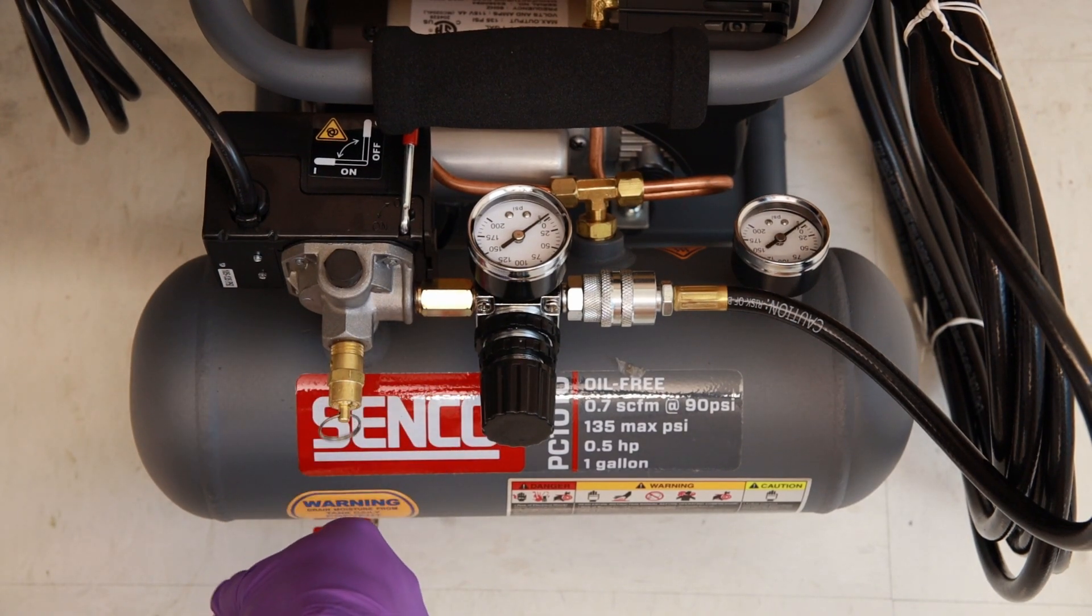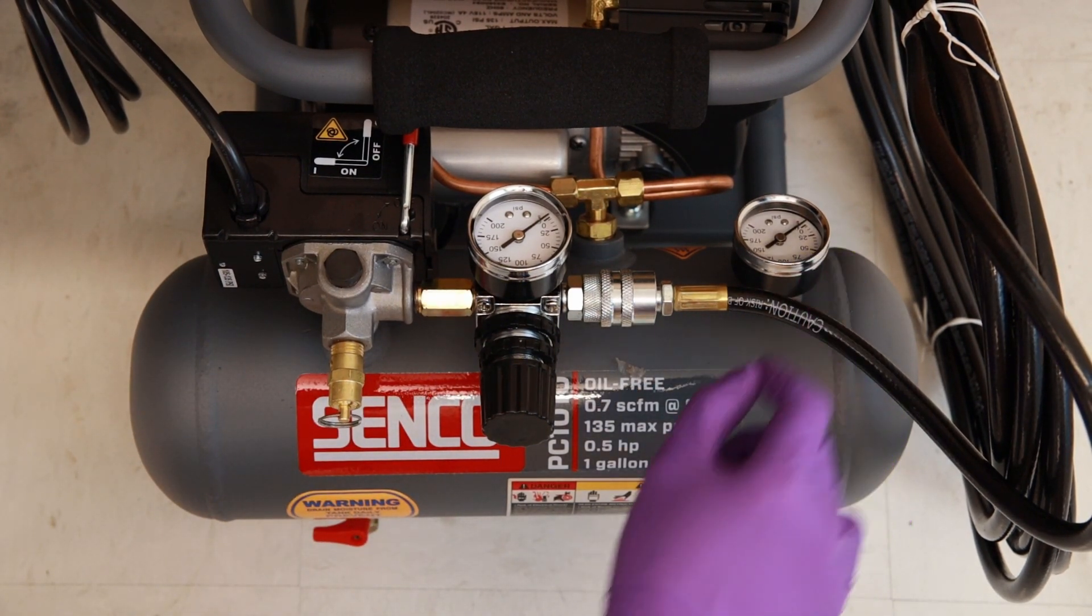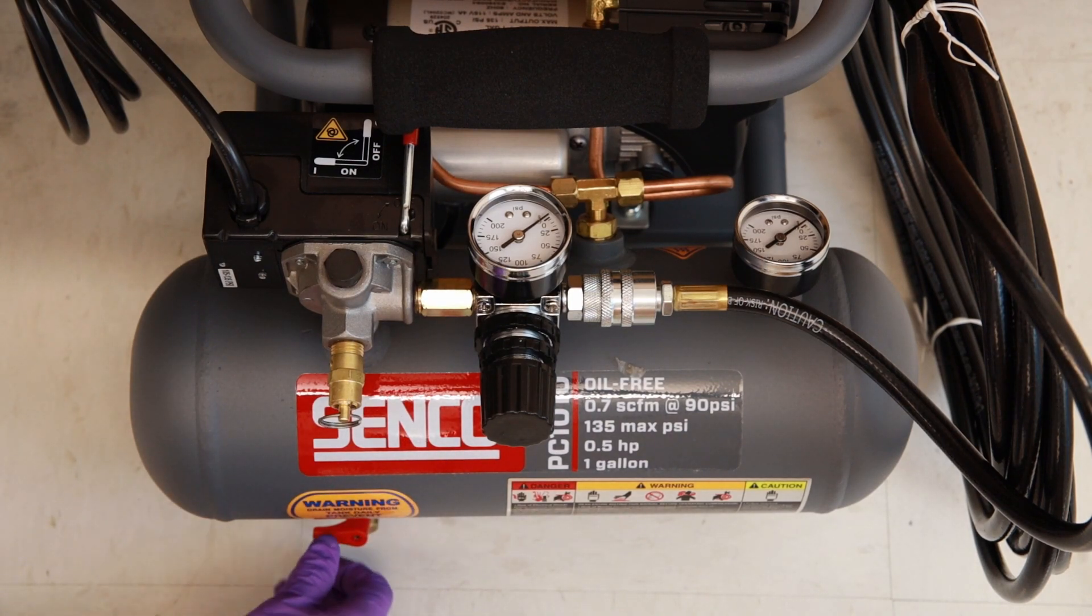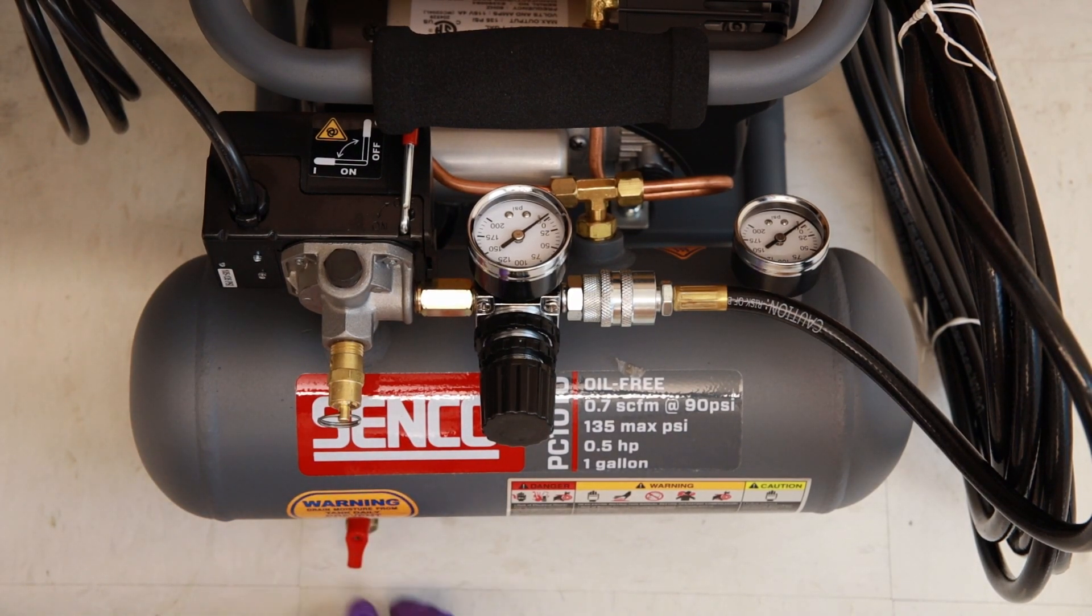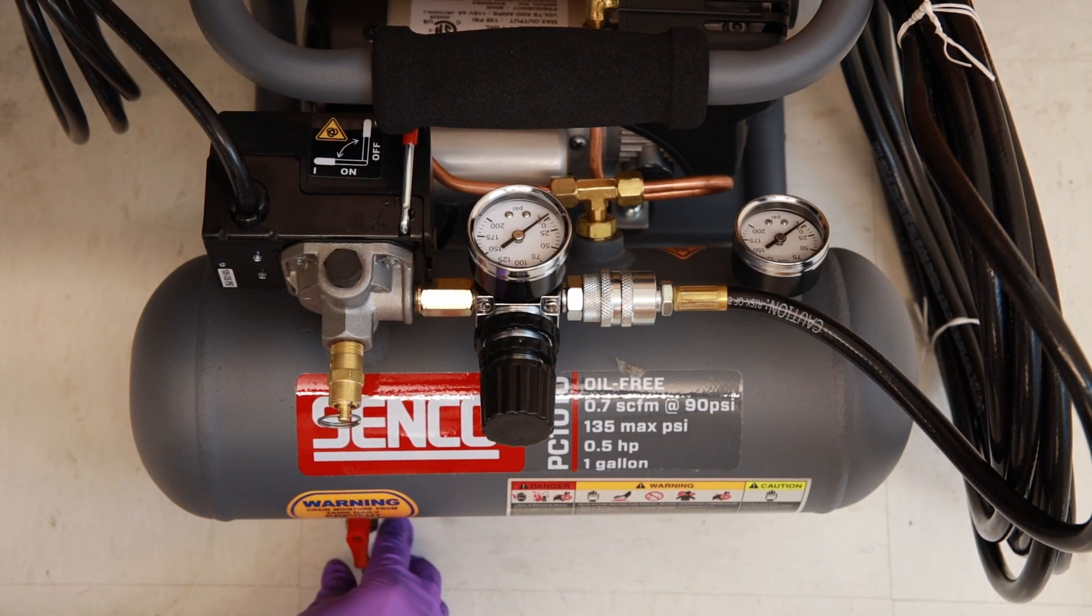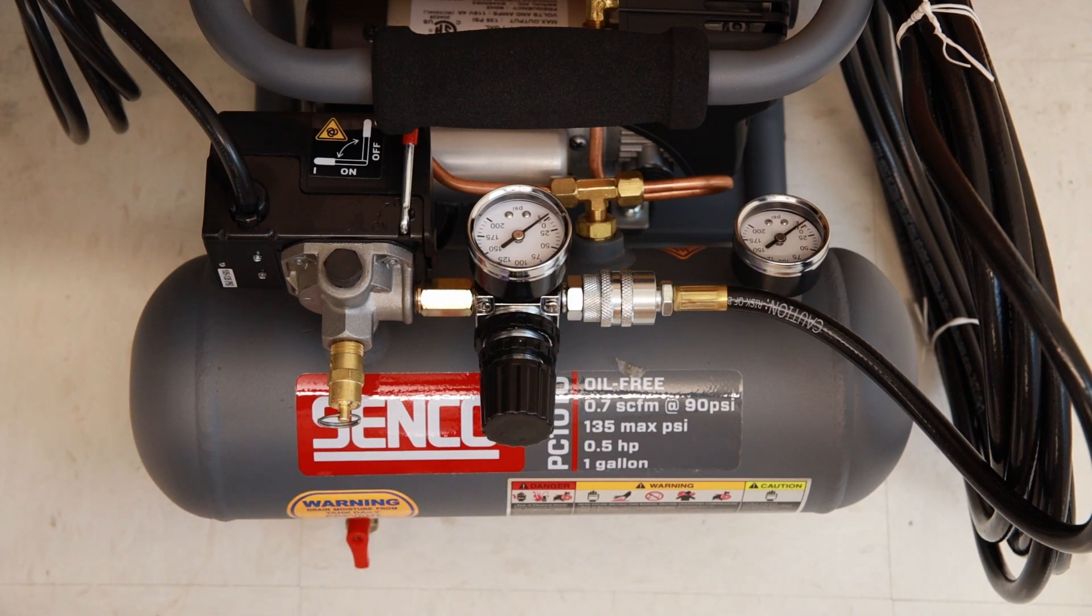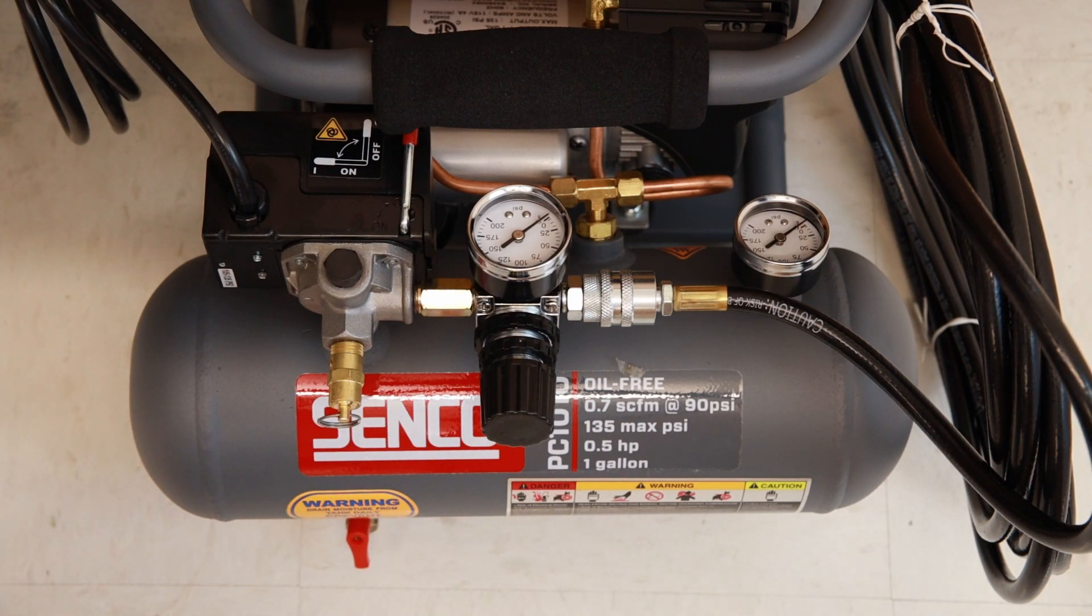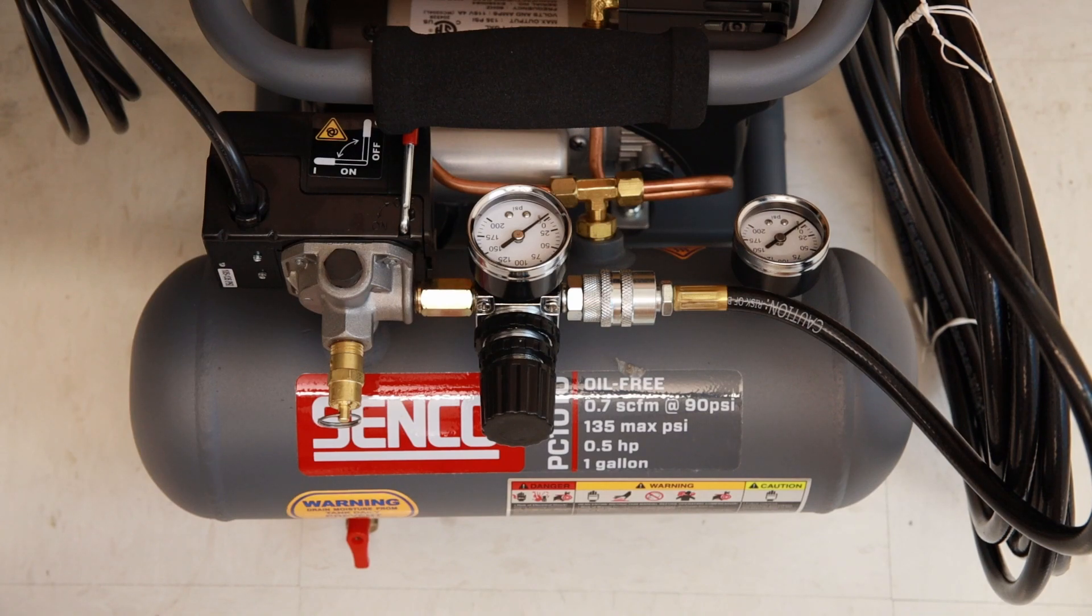Once the pressure on this gauge reads zero, open the valve here to remove any condensed air in the tank. Please perform this routine every time to prevent water accumulation in the tank. Condensed water in the tank can cause corrosion and lead to failure of the air compressor.